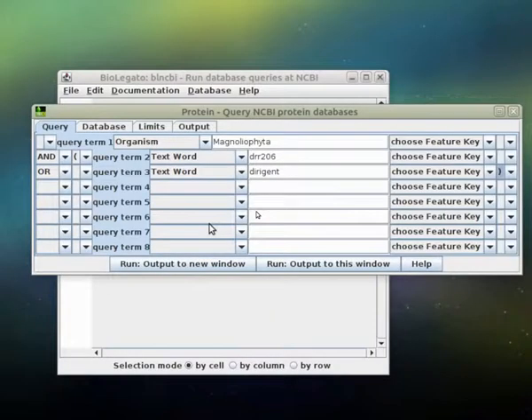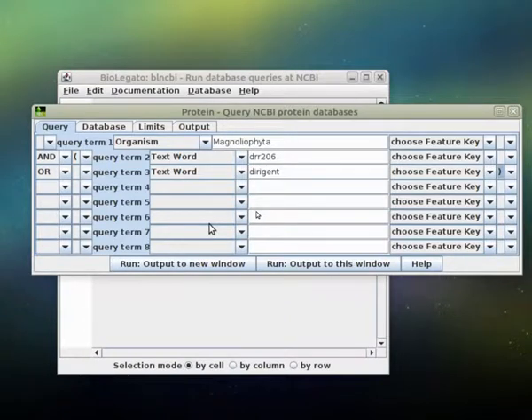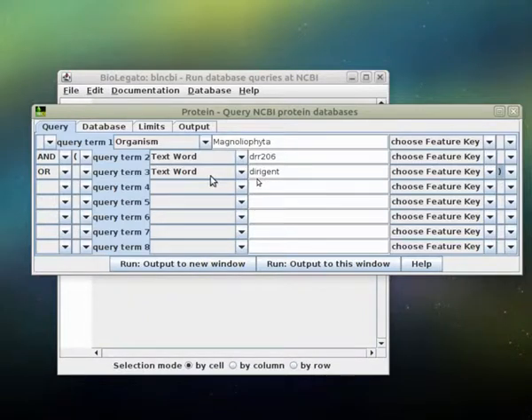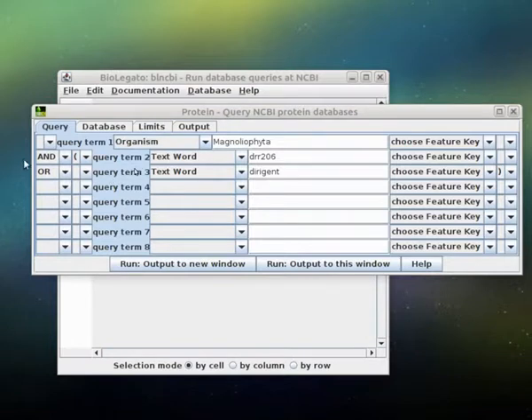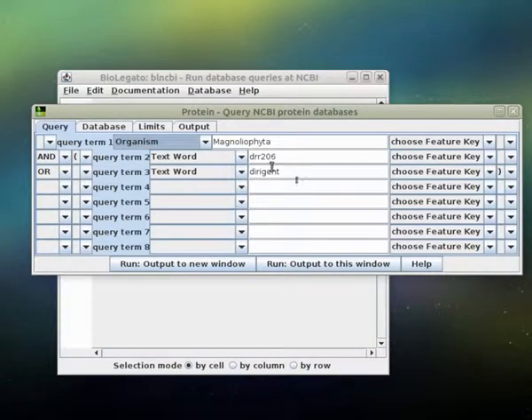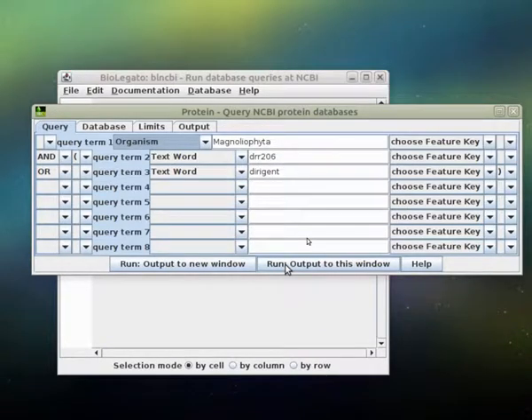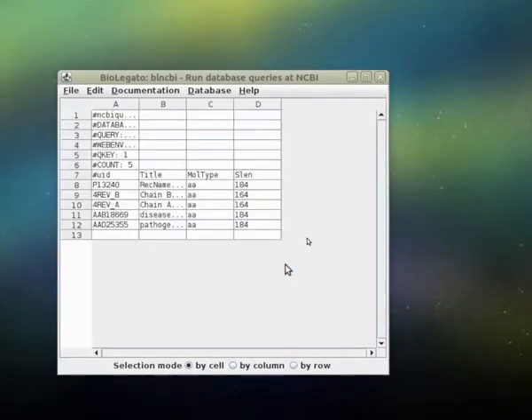As an example, our goal will be to retrieve dirigent proteins from plants. The original dirigent proteins are cloned under the name DRR206, but now are known as dirigent proteins. To get those specifically from flowering plants, we're going to set the organism field to Magnoliophyta, and then we'll have the search look for either of these two terms. We'll run the search, and there we go.